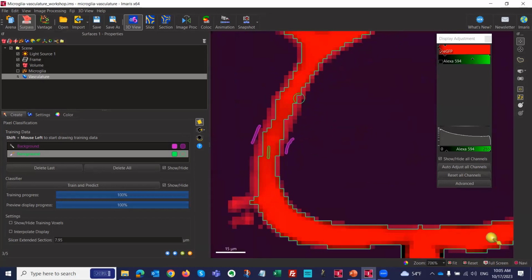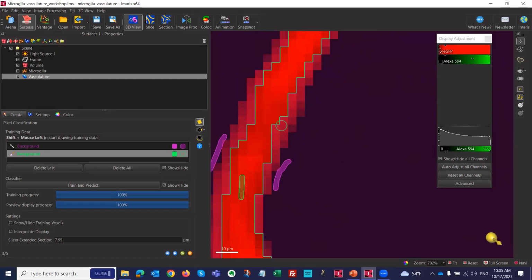And again, it's not perfect the first time because here it didn't capture some, so you just retrain it. It's like, for those of you who have kids, you tell your kid, don't do this, and they will probably do it again. So you have to teach them and tell them repeatedly, maybe after 10 times, if you're lucky, they don't do it again. It's the same thing here.